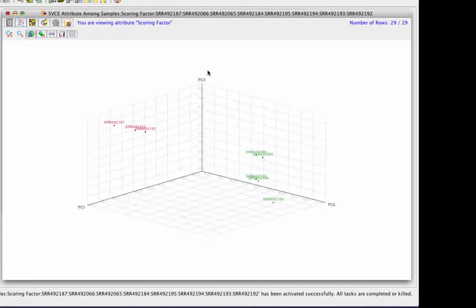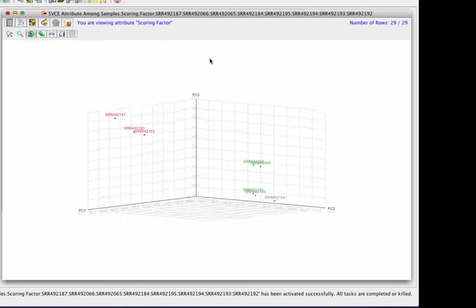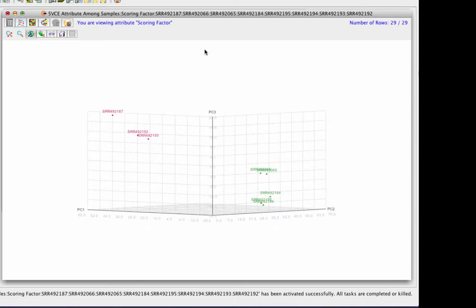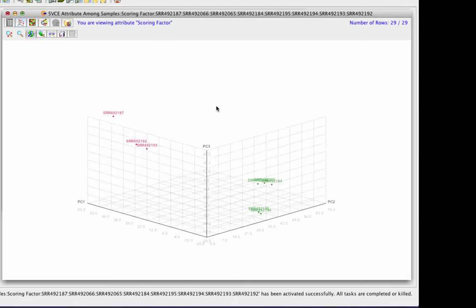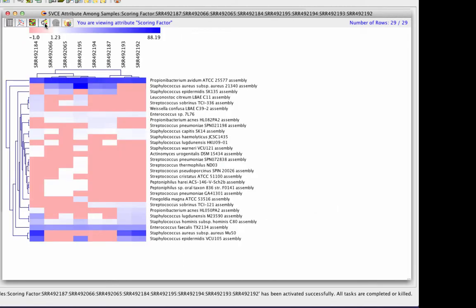PCA analysis of the infant gut microbiome demonstrated that there are two different populations which become more distinguishable based on the days the samples were taken.